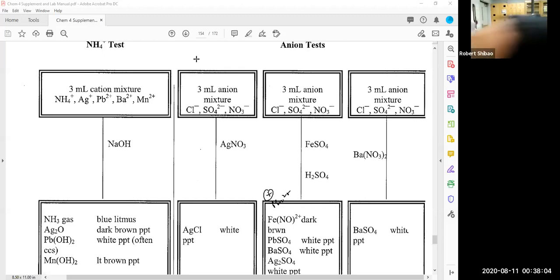Here, I got a lot of precipitate. I got this much precipitate. I need to filter this out probably, although this precipitate doesn't look as dense as that last precipitate. So it might work. Let's take a look at what's happening here.